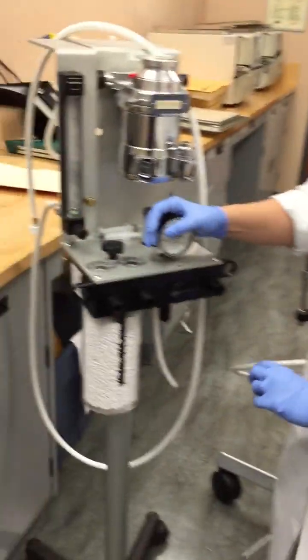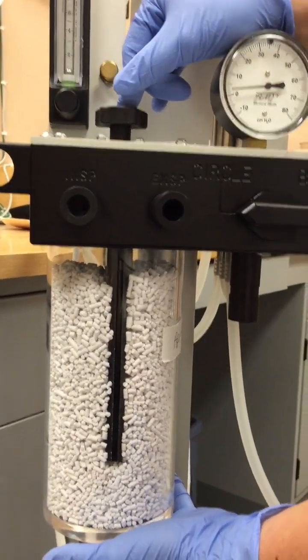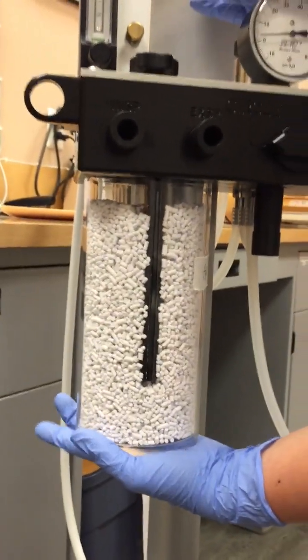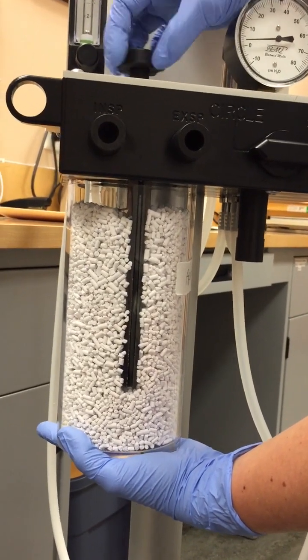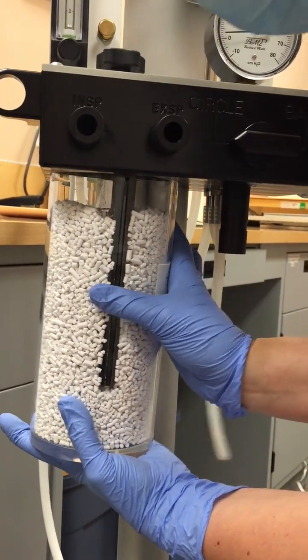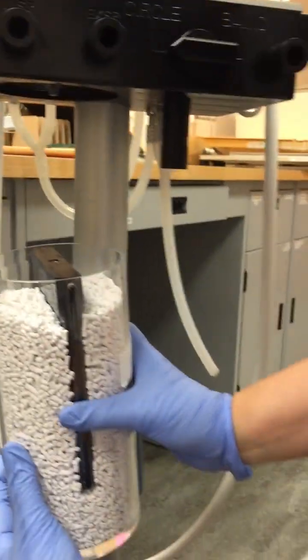Now, for this type of canister, you have to be very careful because there isn't a ledge to hold this in place. Here is the locking screw to keep it in place. You must always have your hand on the bottom of the canister to prevent it from falling on the floor. I am going to unscrew the knob, so I'm turning it counterclockwise. And I can feel that it's already loose. Then I'm going to take my other hand and wiggle it off. If it's not going to come off, loosen it a little bit more, and there we go.